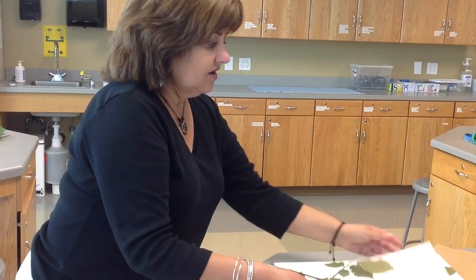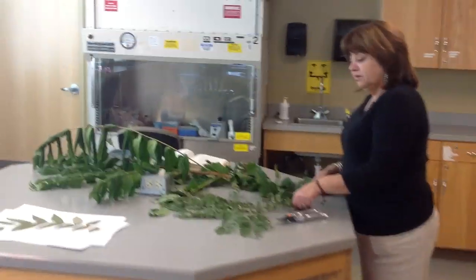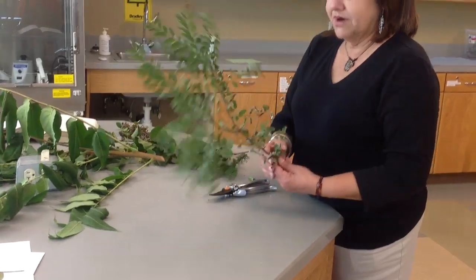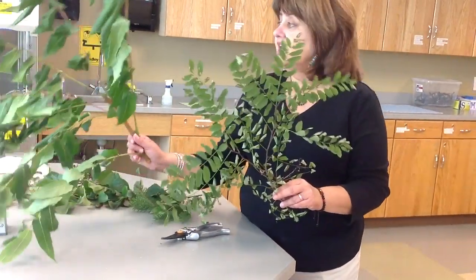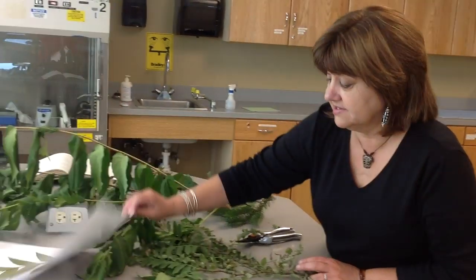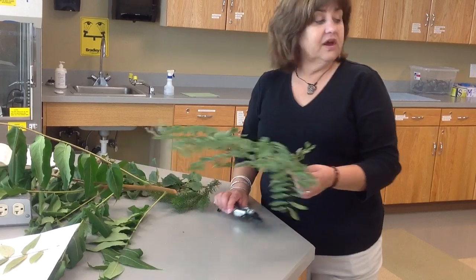I've brought in a variety of different plants — some with simple leaves and some with compound leaves — and we're going to talk about how to press these. Remember, I have some large samples here, but I don't need all of this material to get a sample sheet prepared of the right size.